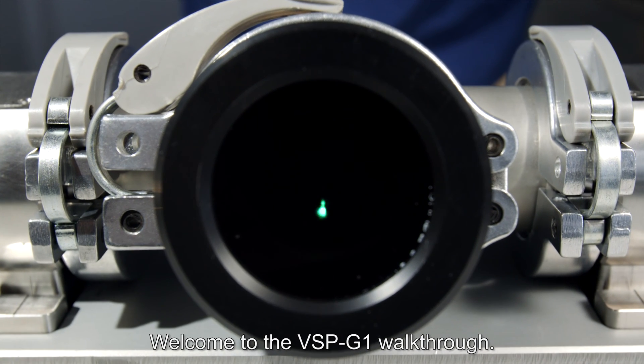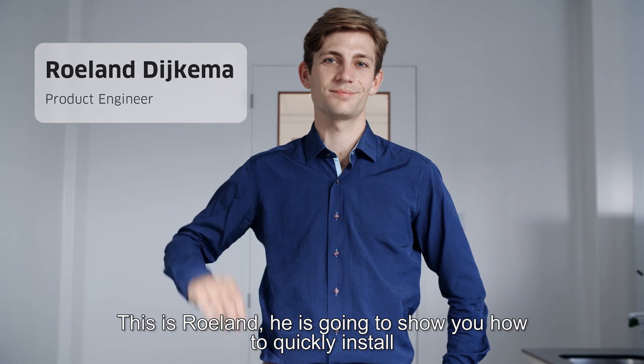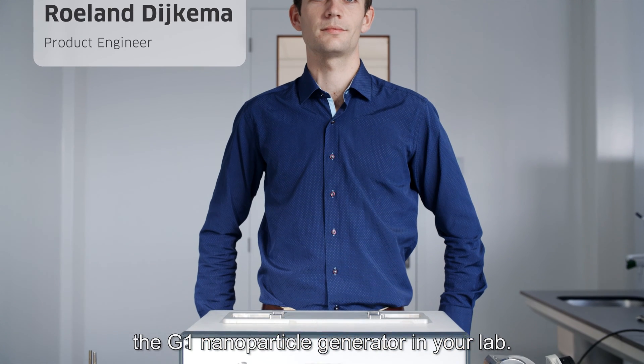Welcome to the VSP G1 walkthrough. This is Ruland. He's going to show you how to quickly install the G1 nanoparticle generator in your lab.